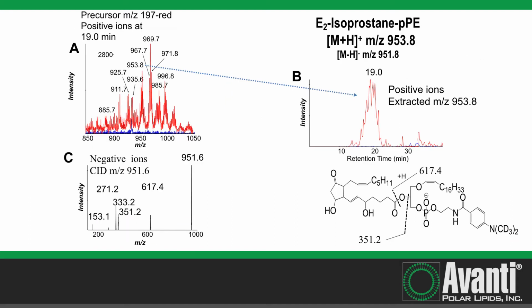If we look at another ion, which is quite abundant a little bit later, it was the one at 19.0 minutes, we see a much more complex number of red peaks, and they're virtually all being derived from this oxidation experiment. In other words, the blue trace, which is time 0, there's none of this. But the chromatographic peaks are really complex. They're all adding together, and they're not forming a nice single peak.